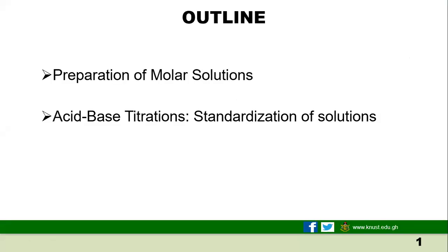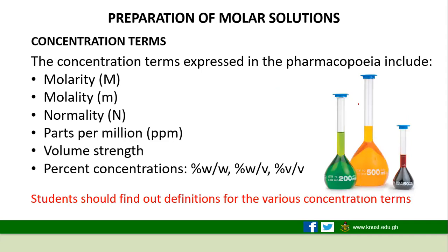Today we are learning how to prepare molar solutions, and then we are learning acid-base standardization of solutions. Very important. These are two key things that we have to take note of, because we'll be applying them in every single experiment. In every experiment, you'll be asked to prepare molar solutions, and in any other experiment, you'll be asked to standardize a solution before using it. So we have to pay key attention to these areas.